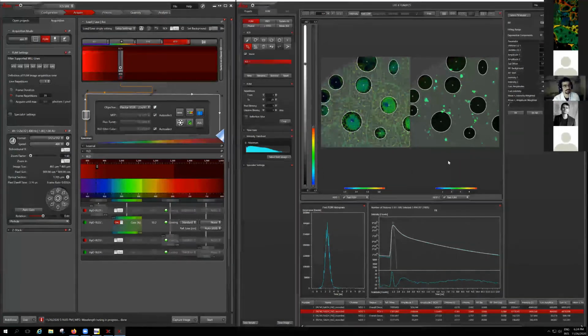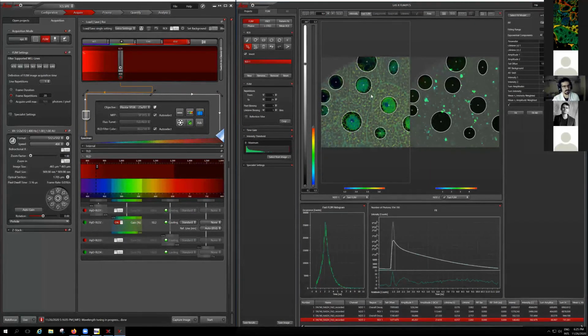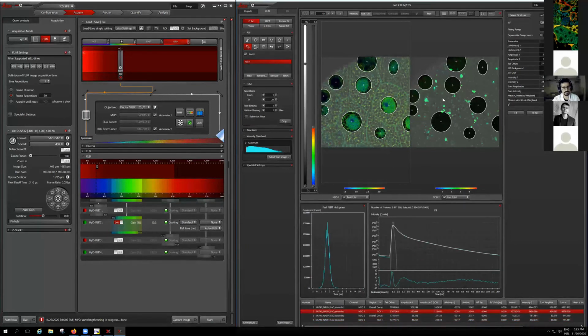Okay, great. So, the data that we have for the NADH is quite clear. The chi-square, as I said, is not 1. And my understanding is that the chi-square from the software is not the reduced chi-square, so it is not necessarily supposed to be 1. And this is what I am told. So 4, 5 is quite okay. By the way, despite the fact that the FAD image and the fitting that we get are not perfect, I would like to show you how the pixel by pixel fitting is applied here.